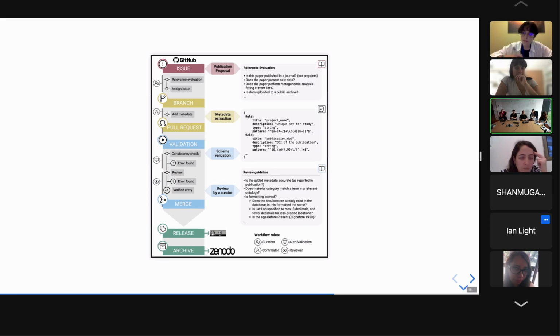For example, for the tutorial on autofill, there was a problem with the DNA polymerase. I actually ended up calling Yates to look at which polymerase they used, because the one they reported in the paper didn't exist anywhere. So the metadata have to come from somewhere, and if at the source they are not correct, unfortunately there is not so much automation that you can do. But let's be optimistic, and I would argue also realistic. In the majority of cases, it should be fine. But you will always have the exception that will take a bit more time.